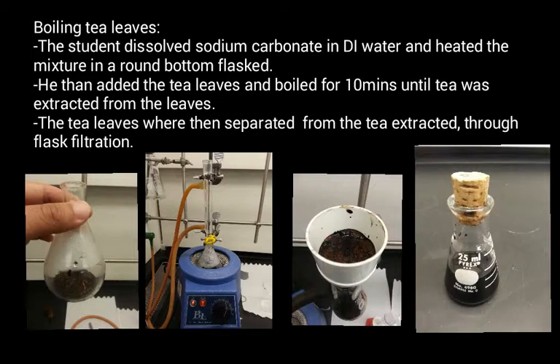He then added the tea leaves and boiled for 10 minutes until the tea was extracted from the leaves, as you can see right here. And then he separated the tea leaves from the tea extract through flask filtration.